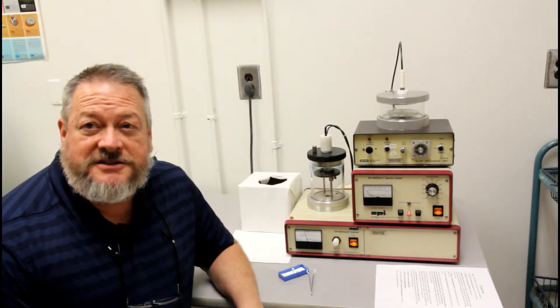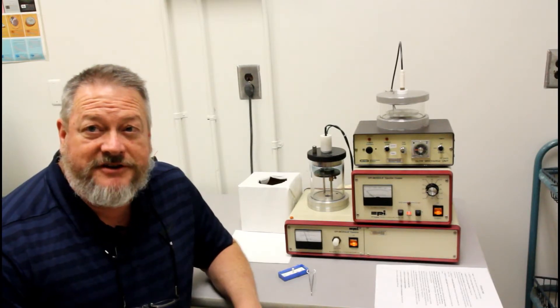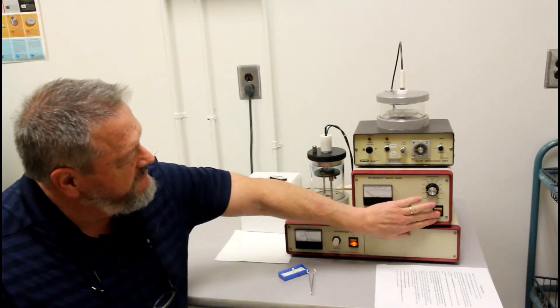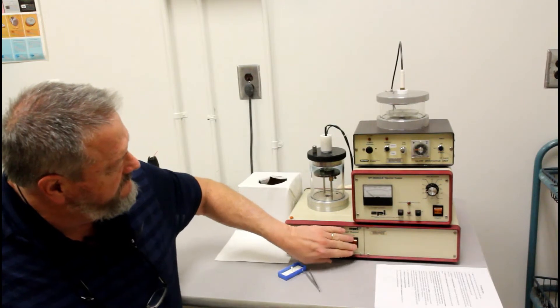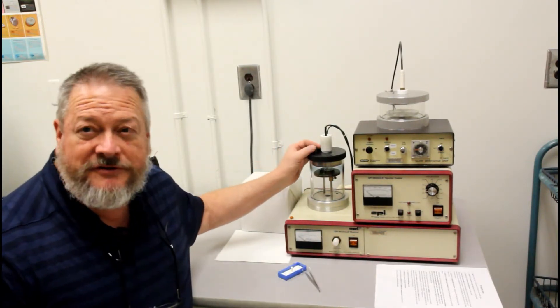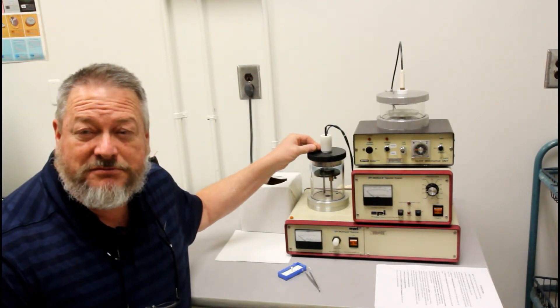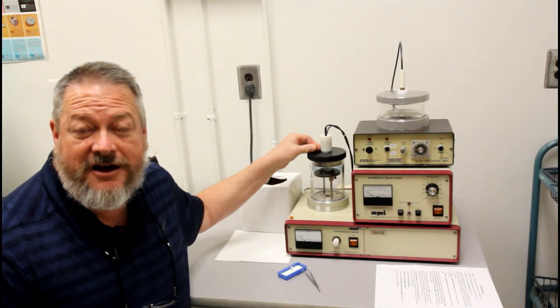Once that's finished, it'll shut itself off. Then we just need to turn everything off and vent the chamber. Now you don't want to vent it too quickly. If you do, you might blow your sample off of the stub.